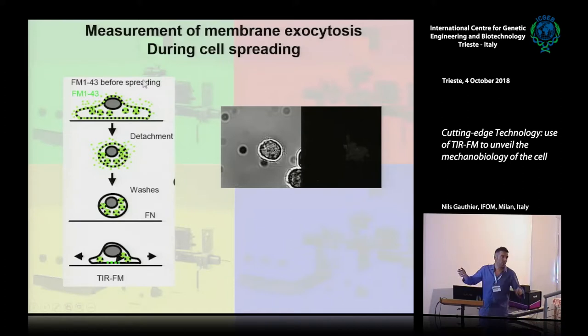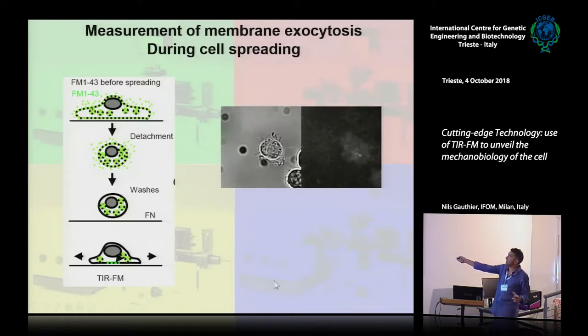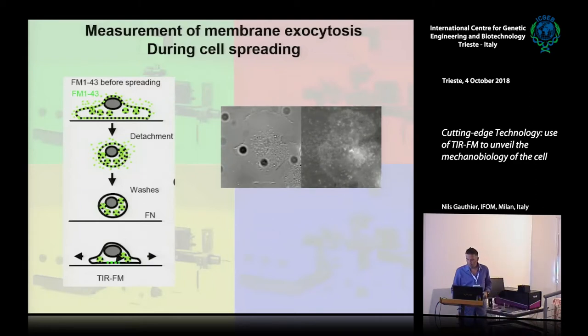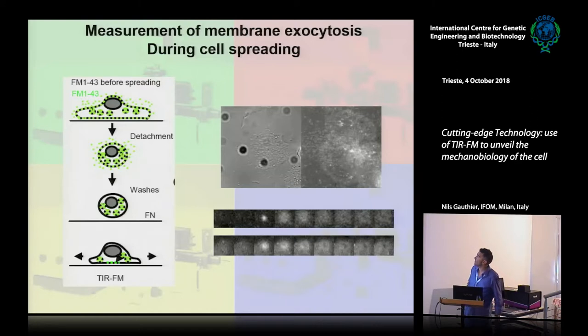Again, this system was the prism system, lower resolution but much more statistics. You can see this type of event: it's dark, and then progressively you have those bursts of exocytosis that come out. Here we have relatively low resolution, but we have naive information. Stuff is going out, and you can even see that the coverslip is getting brighter, meaning the cells are releasing dye. And you can analyze them, they are very consistent with exocytic events because they dock and diffuse afterwards.